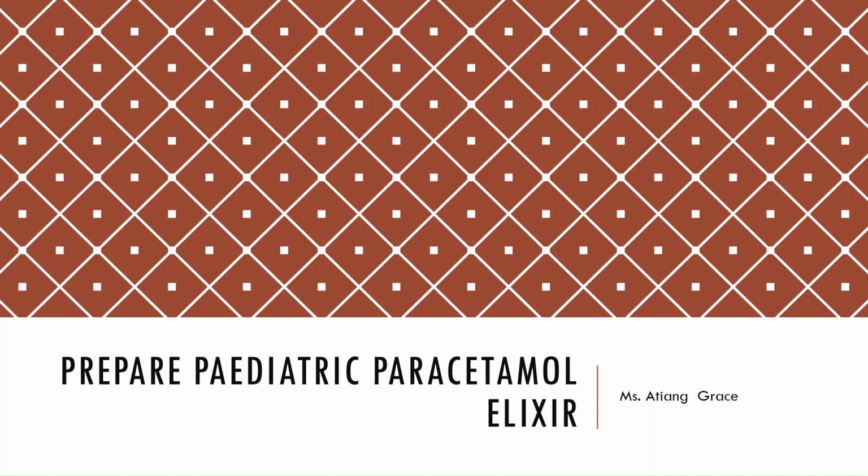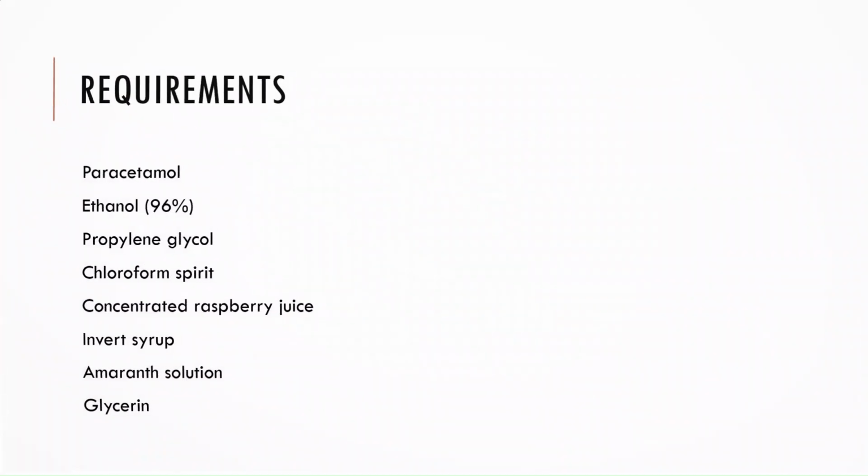We are here for you, and today we are here to guide you on how you prepare a pediatric paracetamol elixir. So let us look at the requirements that we need to have when we are thinking of preparing a pharmaceutical elixir or a pediatric paracetamol elixir.